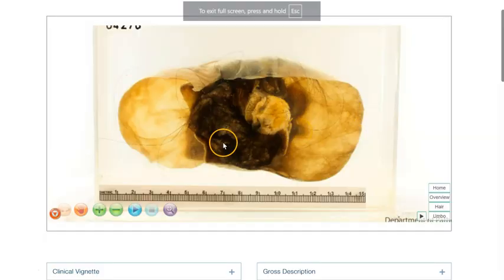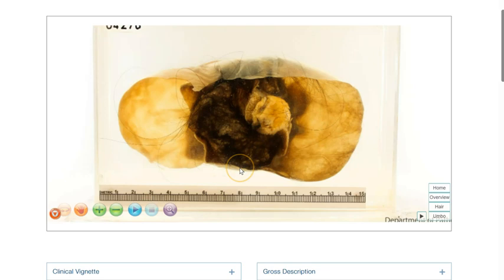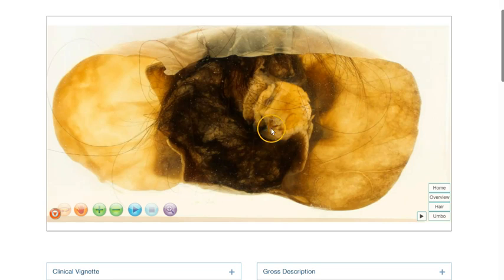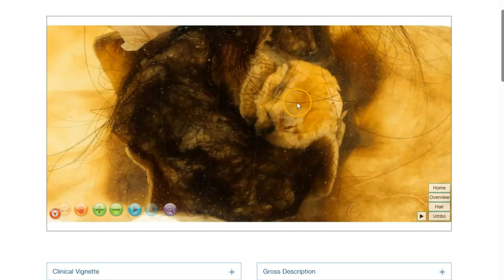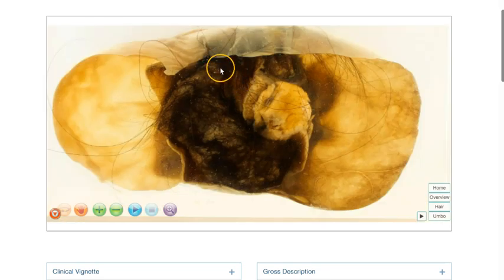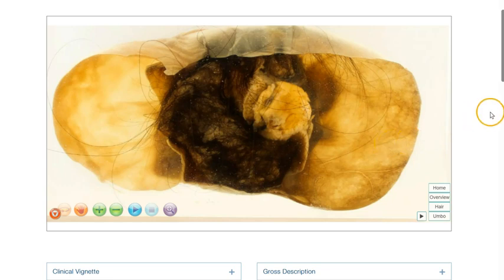In summary, this is an example of a virtual pathology specimen of a mature cystic teratoma of the ovary. This shows a paucilocular cystic mass, and within the central locule, we can see the solid umbo or protuberance, which is covered by skin. We can see adipose tissue on the cut surface, and there is a lot of hair within this cyst locule. The mature cystic teratoma is a benign neoplasm, and treatment is resection.